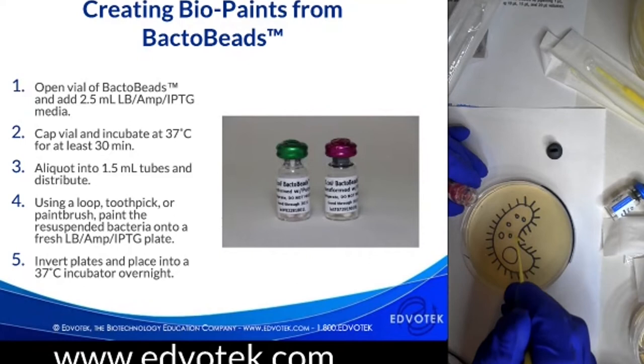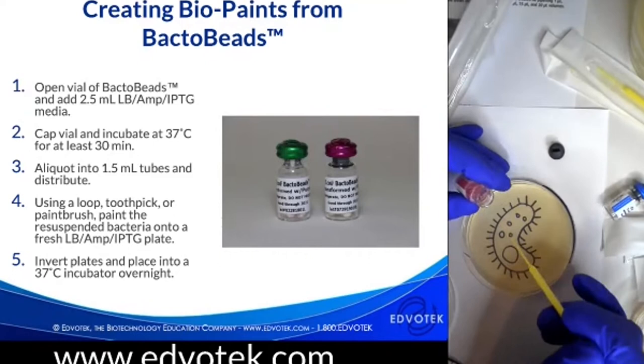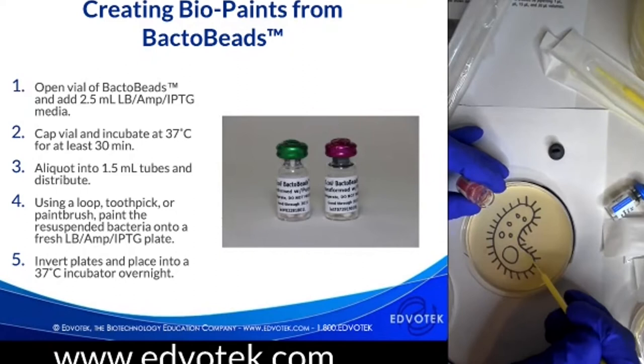So I'm using the loop end. My particular disposable loops have the pointing ends too, so that you can easily trace and get a little bit more precision than the loop.